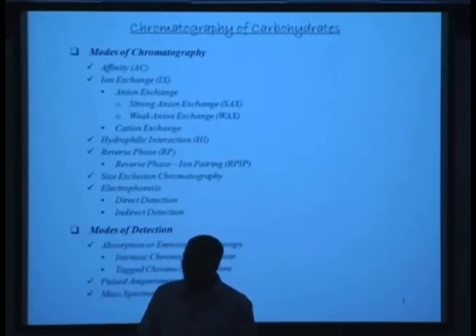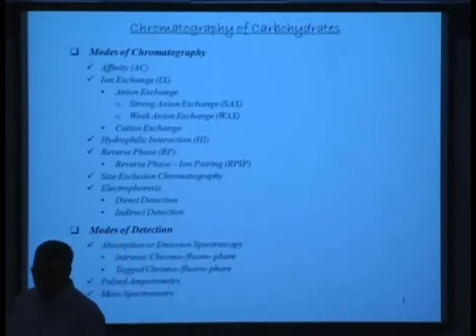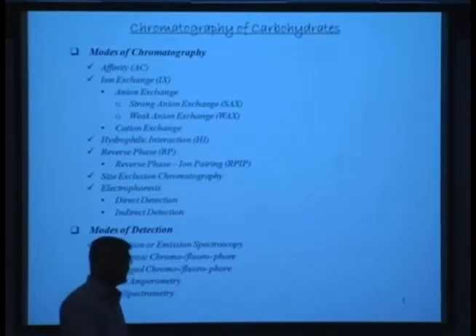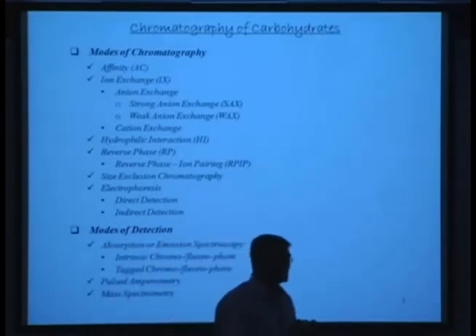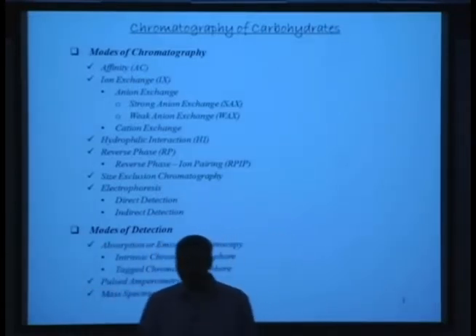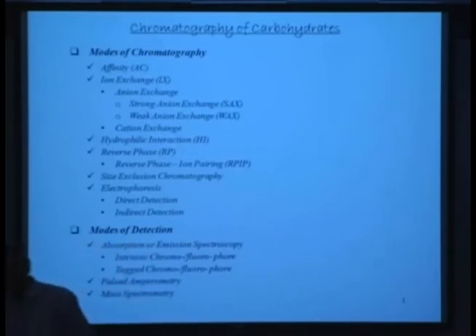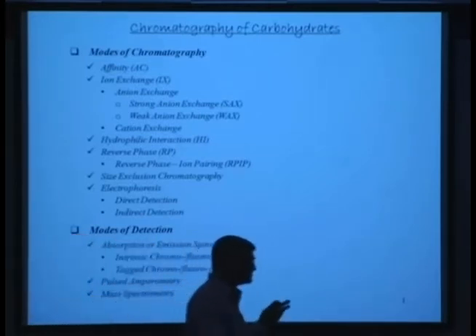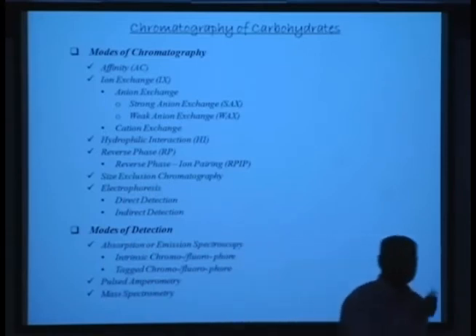So if there are multiple hydroxy groups, detection using IR should be more facilitated because you have a higher extinction coefficient. And yet IR for glycans is not typically used. Why? Obvious answer. You don't have to think a whole lot.